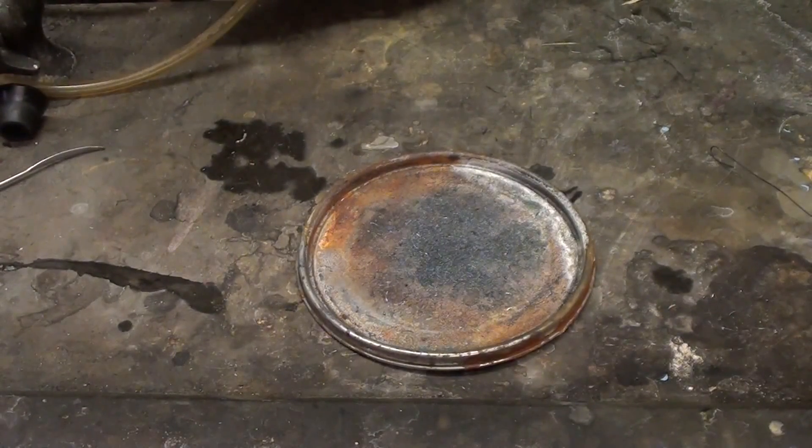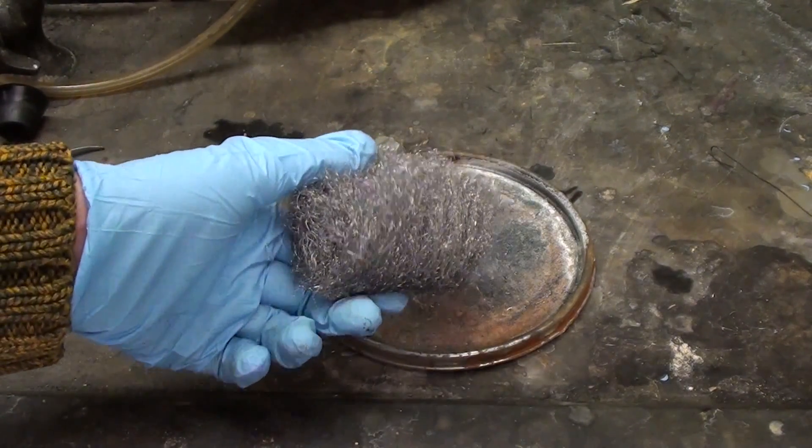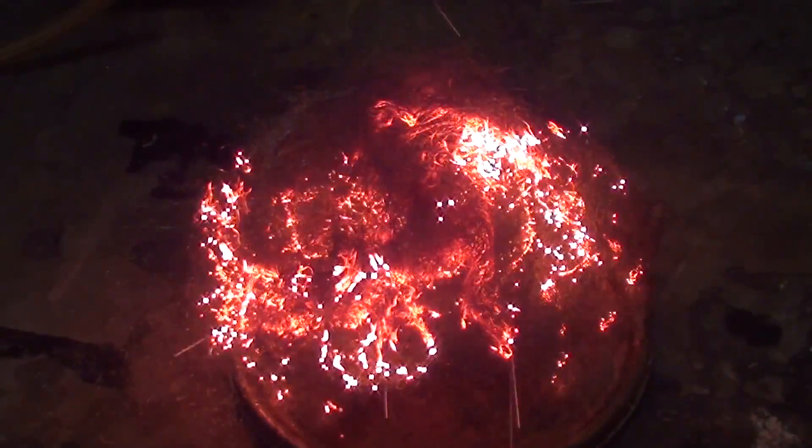Greetings fellow nerds. Let's do some really basic chemistry again. I have here some steel wool. It doesn't look like it, but it's actually quite reactive with air.